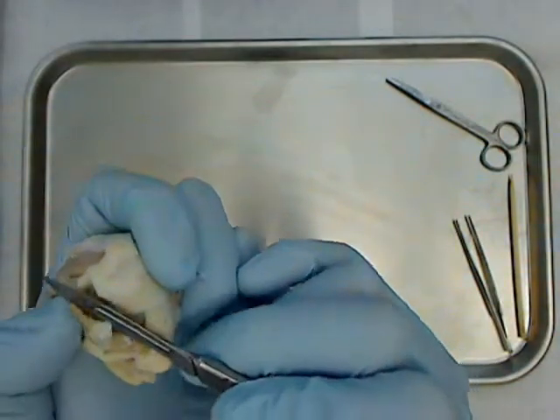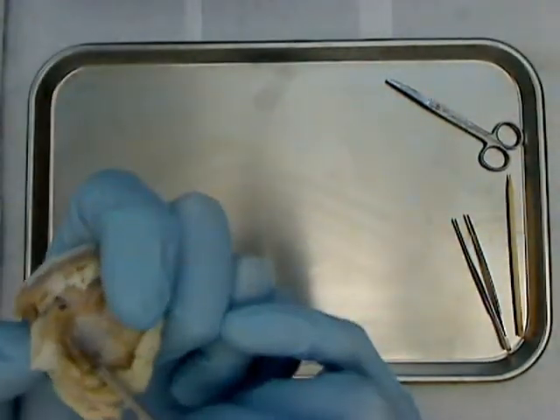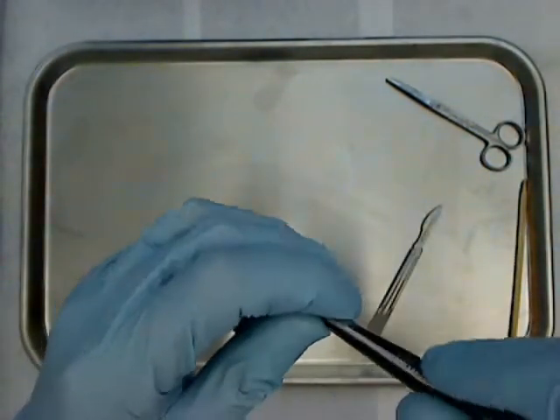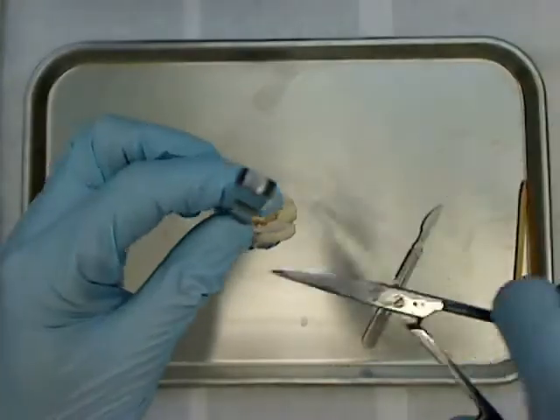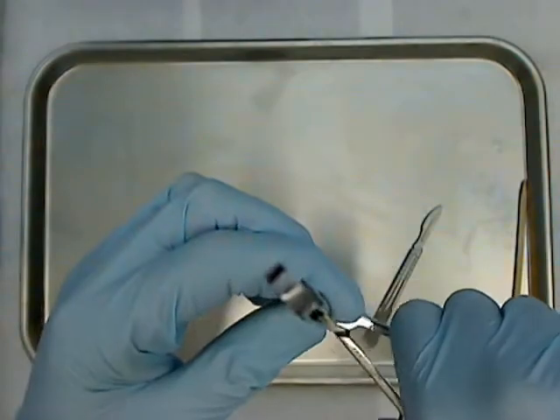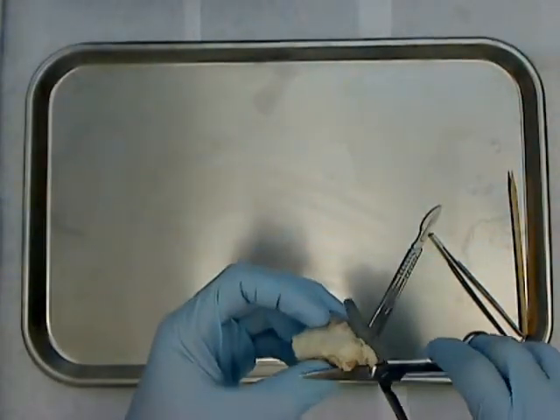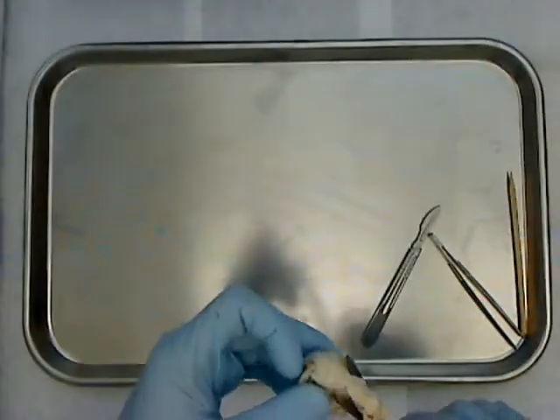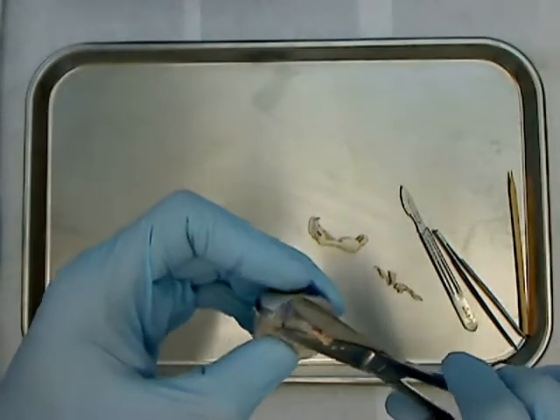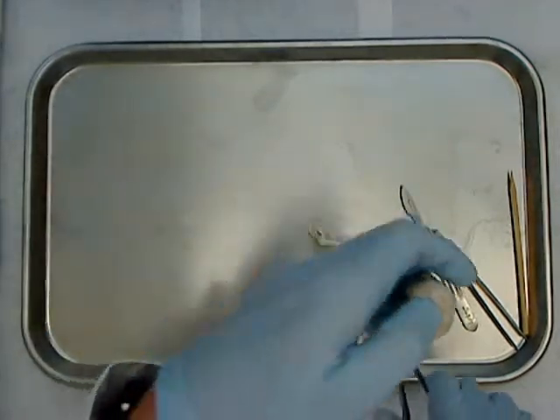I'm trimming this tissue away, starting back by the optic nerve to make sure I don't cut it more than it's already been cut — it's quite short on this eyeball. One of the most efficient ways to do this is to hold those thick tissues and use scissors to trim. The muscles you see here are extrinsic eye muscles; it's difficult to tell which is which, so all you'd need to say is extrinsic muscles.